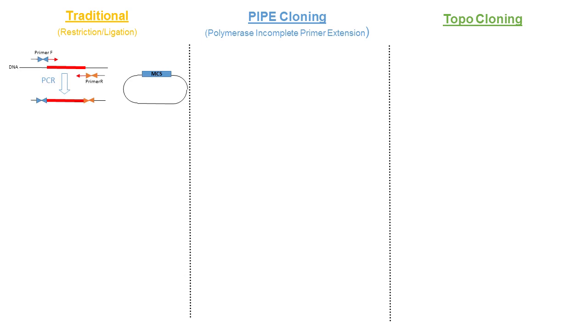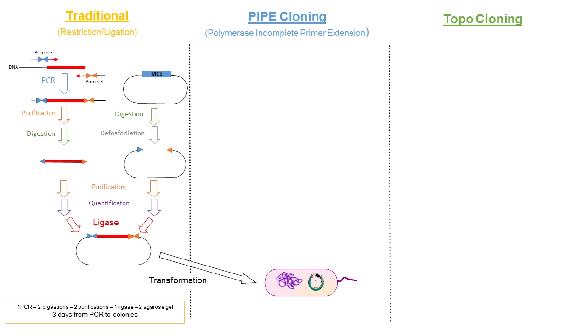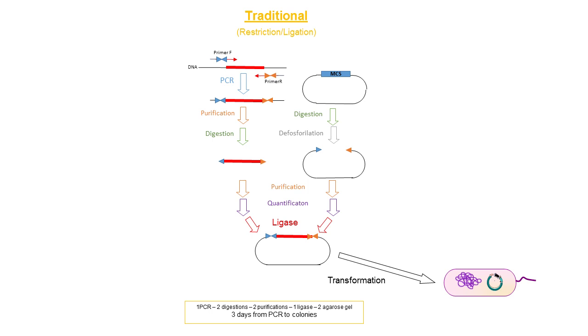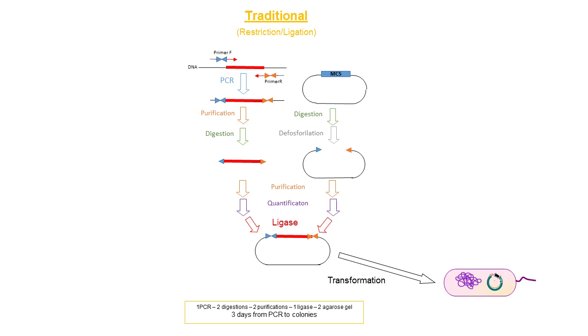So, as you can see from the slide, traditional restriction ligation cloning, that is still maybe one of the most used cloning methods, requires many steps, so it's quite time consuming. It requires a specific vector that contains the multi-cloning sites and is not applicable to all genes, because you have to carefully choose a couple of restriction enzymes that do not digest your gene.